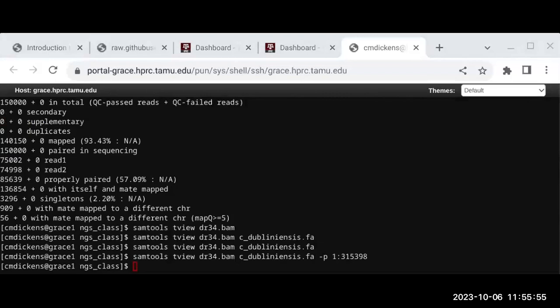There's a better view of that. I think it's the first time I tried it on the browser. Maybe it might be this browser. Is anyone trying it on the browser? Does it look bad? Did it work okay? It's doing the same thing. Oh, it shifts over. So I'll have to put a note on here: this is better to run on the terminal. In the past, I had been using the terminal, but the portal is really useful, so I was going to run it on the portal. But I'll put a message in there. I'll update the slides to use the terminal for that part.